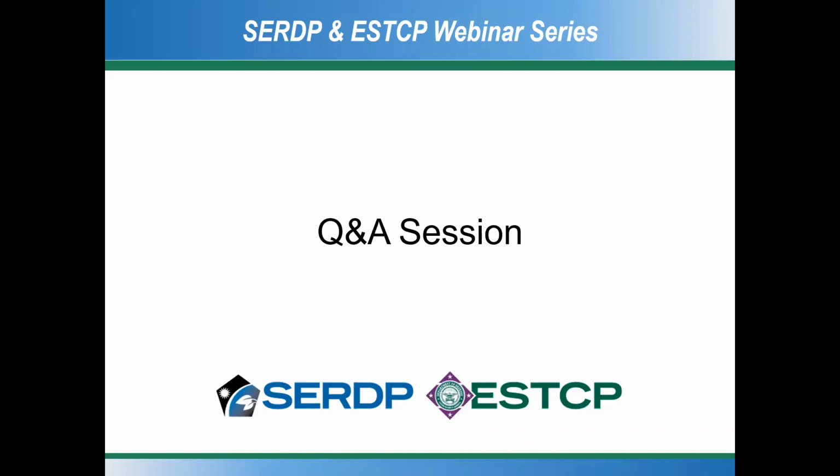Okay, so if I talk really slowly, I can dodge the EPA question. Detection limits for the tube sampler are in the low nanograms per liter or below. So it's a sensitive tool. The nanographene is a little higher just because the actual mass of carbon we have in that sampler is fairly small, which is both a benefit and, I guess, a challenge. But of course, a lot of the work that DoD is interested in is at slightly higher concentration sites. So detection limits haven't really been a problem for us in most situations.